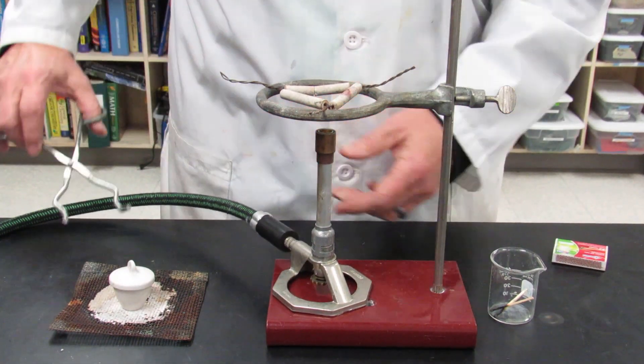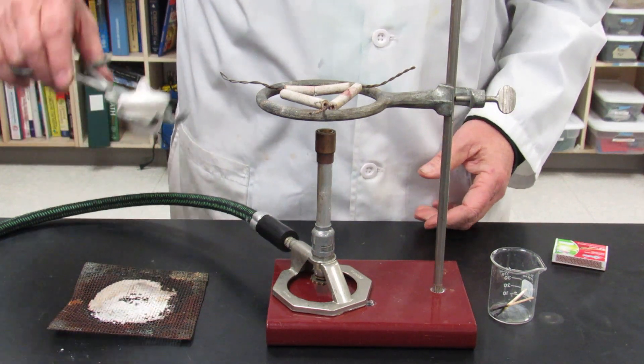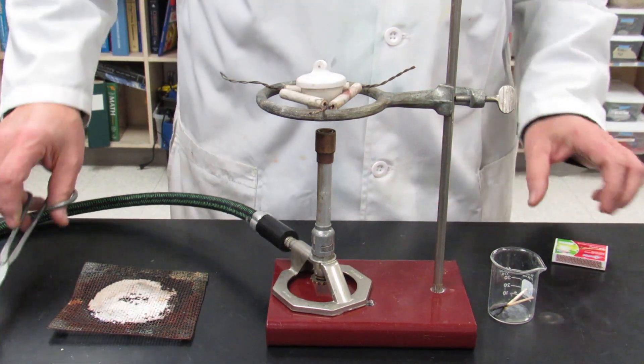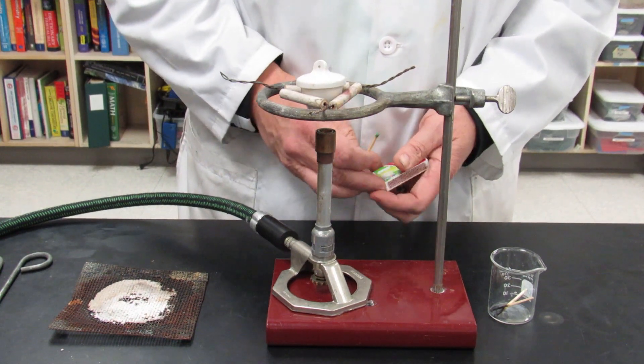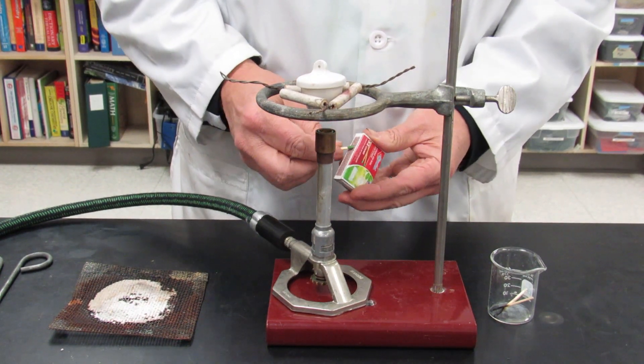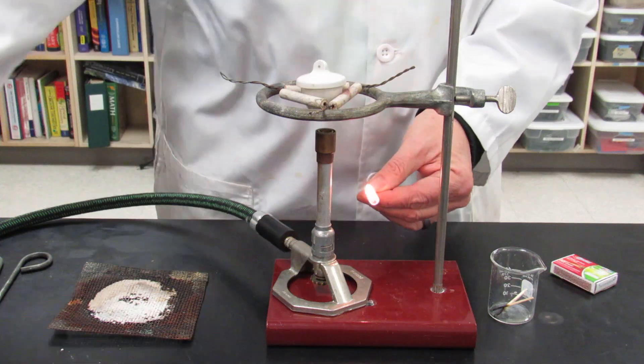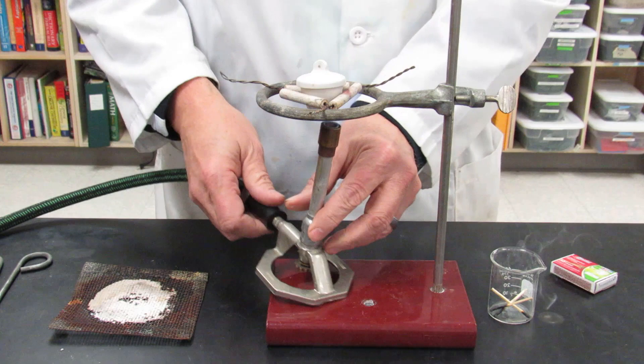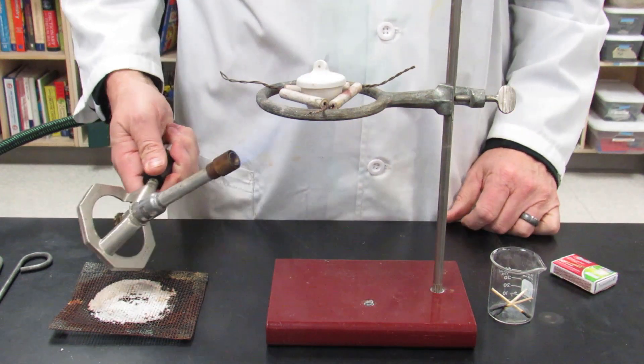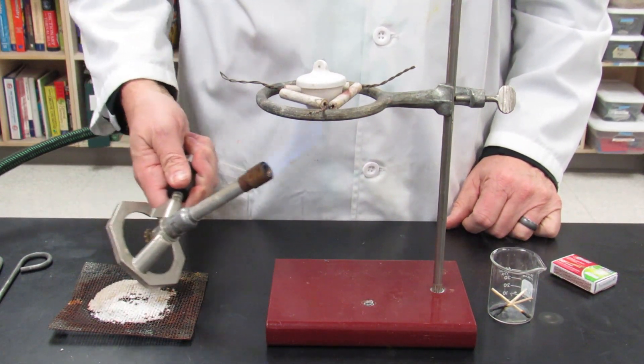Now it's time to oxidize magnesium. You're going to put the crucible on the flame. Light the match. Turn on the gas. Turn the flame up. Get a good hearty flame. Gently start. Always gently start for a minute or two.